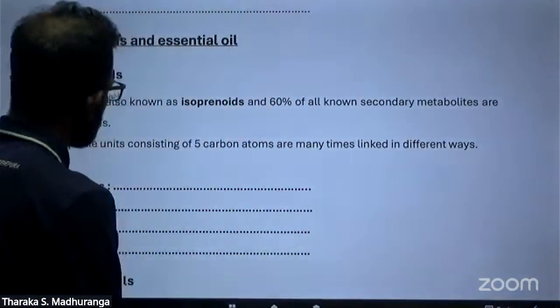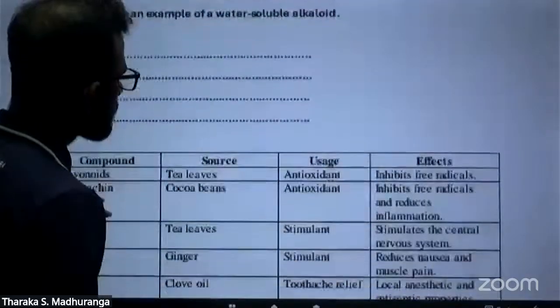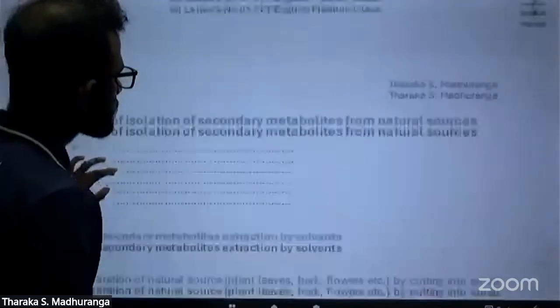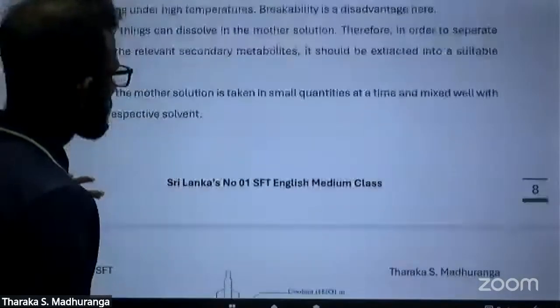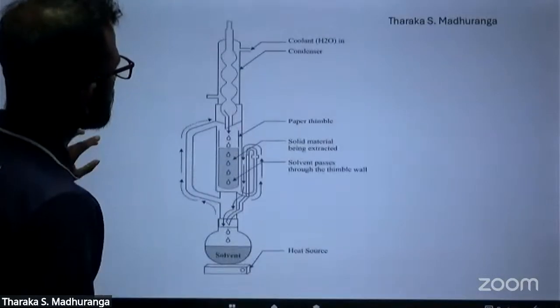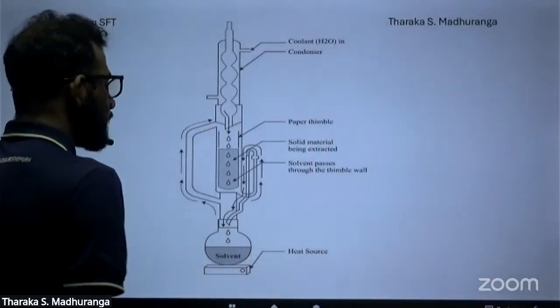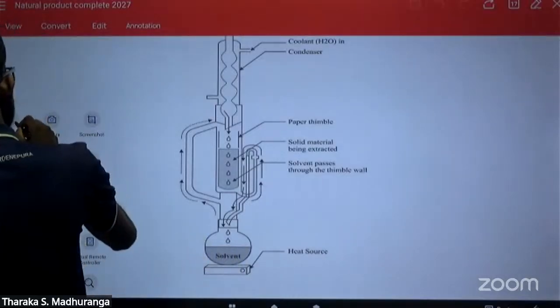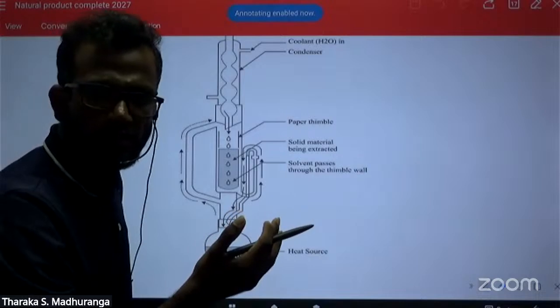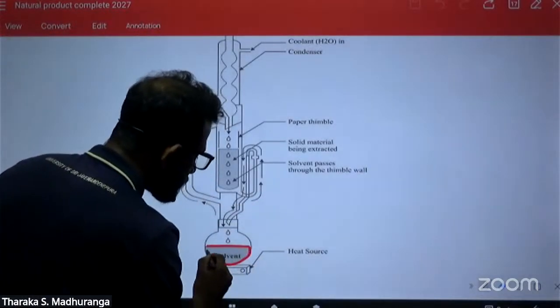Yes. Okay. In this solvent extraction, do you remember what the working principle is? Yes, this is the structure of the Soxhlet extraction. This is the structure I told you. Just to refresh, still last day's lesson we discussed. This is the solvent.